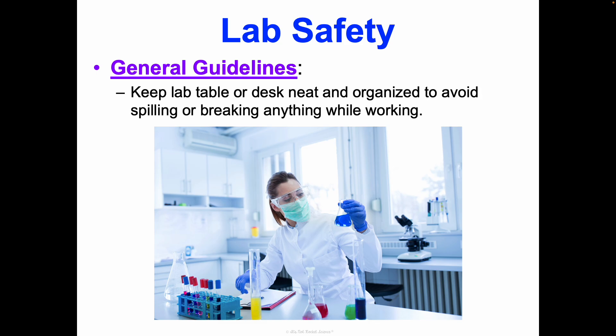You have to be sure to keep your lab table or desk — wherever you're working — neat and organized, because it's so easy to bump something and all of a sudden knock over a test tube and spill or break something. I really recommend not even having your full binder out while you're working; just pull out the lab pages you need. Never any food or drink — only the bare minimum so you can focus on the lab. Accidents happen, but a lot of accidents are very preventable.